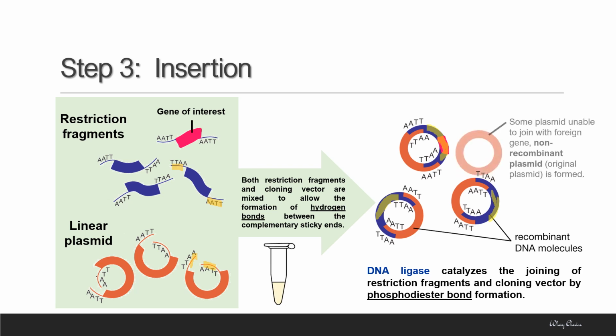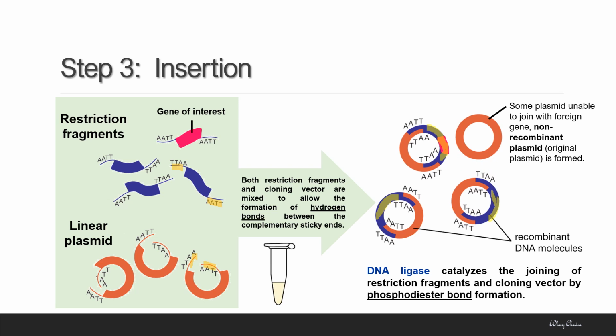However, there are some plasmids that do not have enough time or do not have the chance to get close to the restriction fragments. So the sticky ends will pair up together and form an original plasmid.